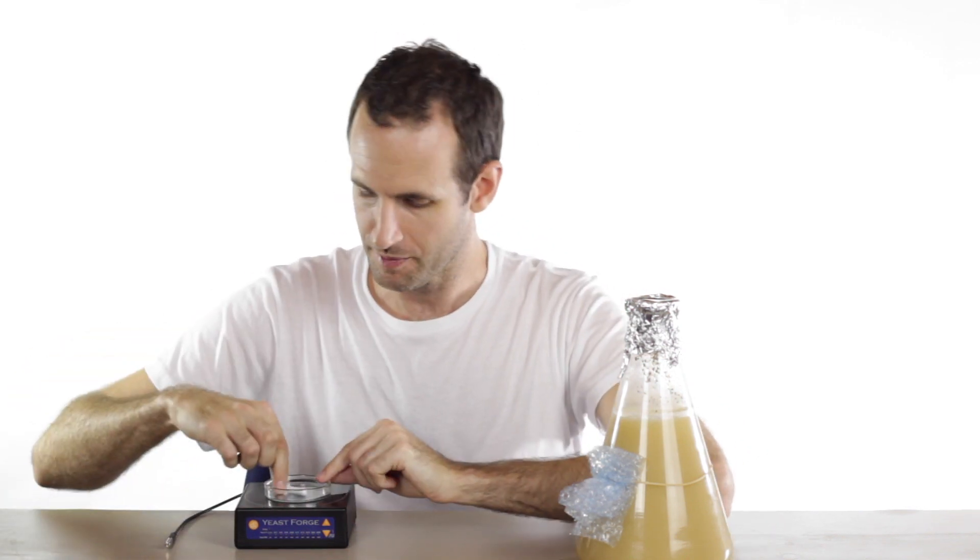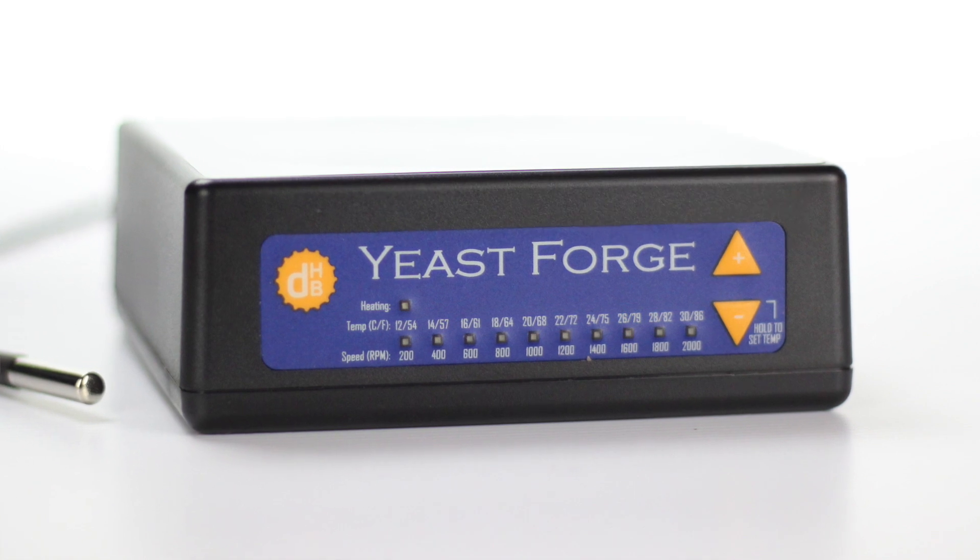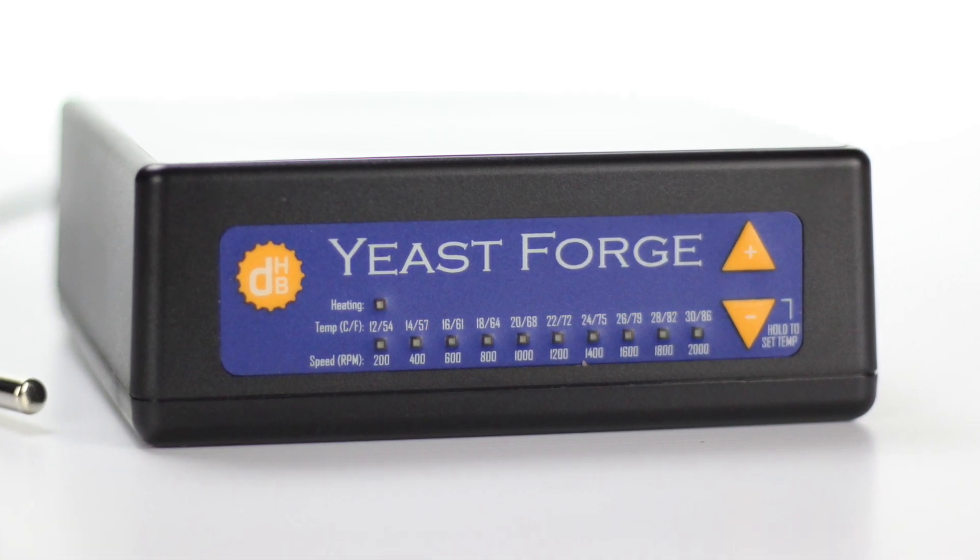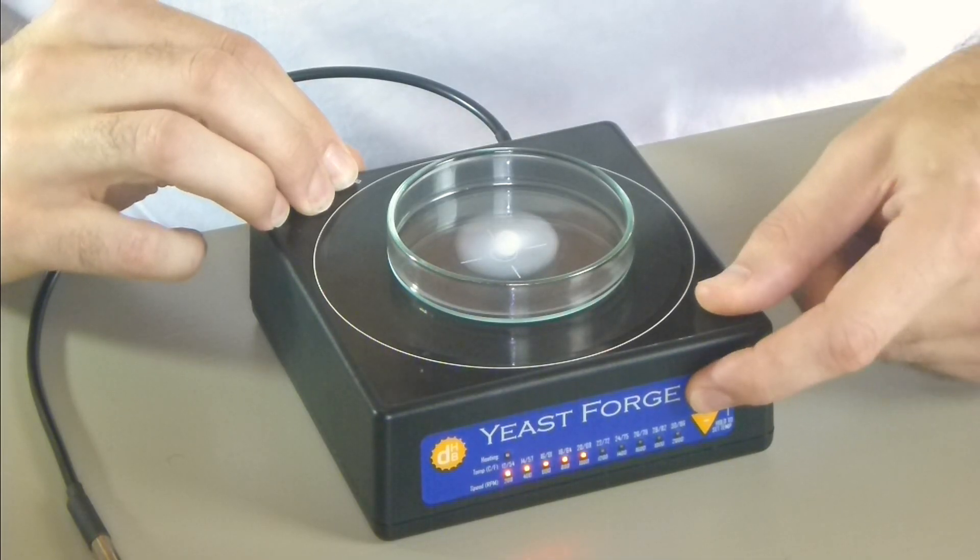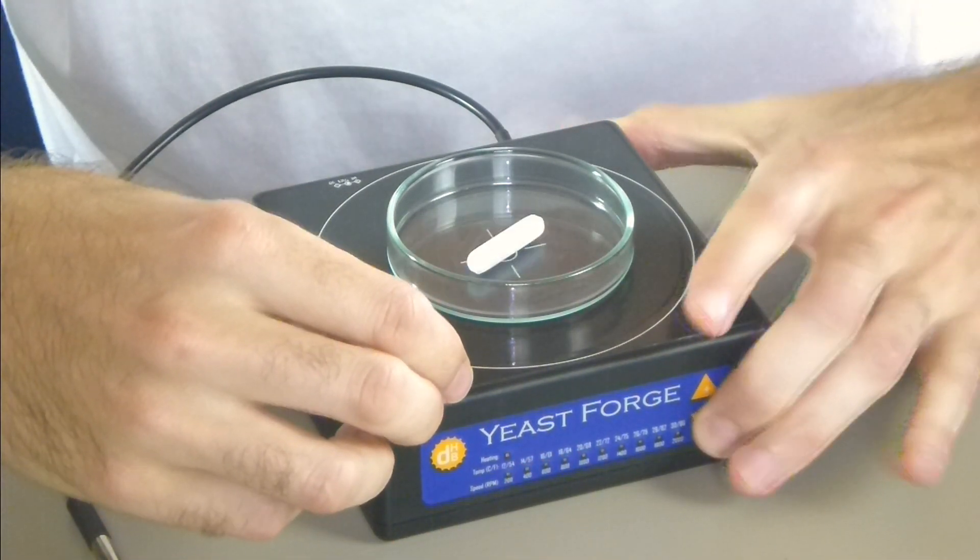Here I've got a magnet stir bar and it's just sitting in a petri dish so you can see it. And to set the speed of that spinning, it's just a simple up and down interface on the front of the stir plate and that can go anywhere from 200 RPM to 2000 RPM.